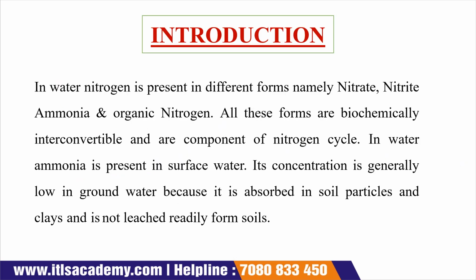We all know that in water, nitrogen is present in different forms. Okay, this is your glass of water, and in this glass of water nitrogen is present. This nitrogen is present in different forms.